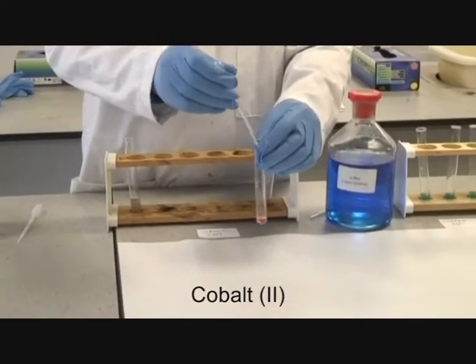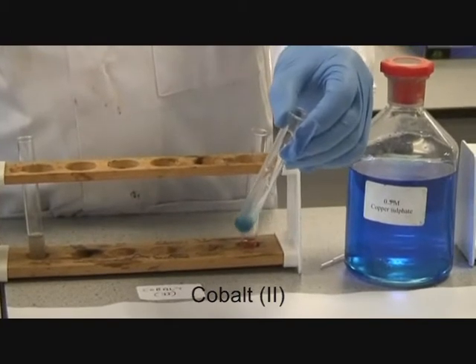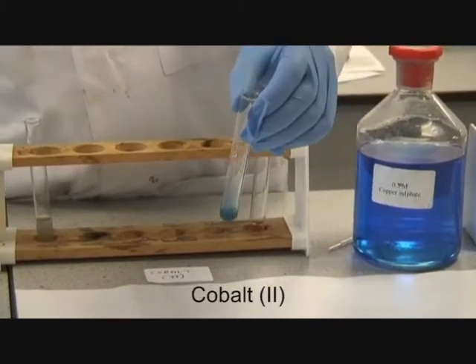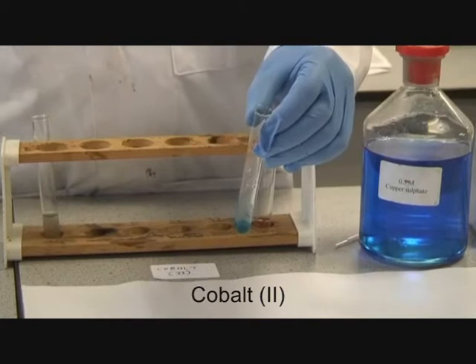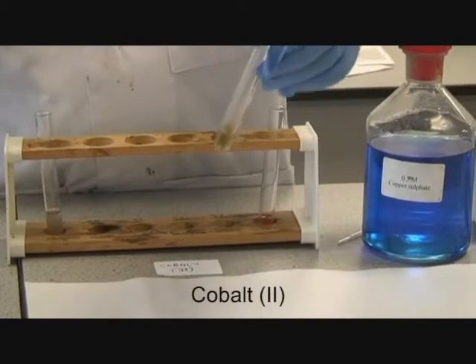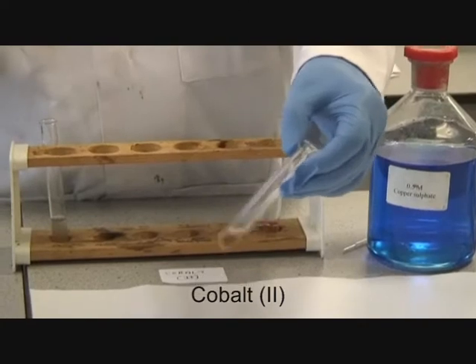Using cobalt-2 and ammonia, you again get a turquoise blue precipitate. On addition of excess ammonia, you get immediate oxidation to cobalt-3, which is the brown colour.